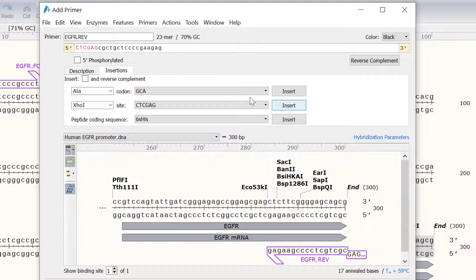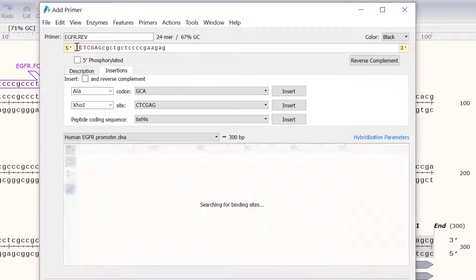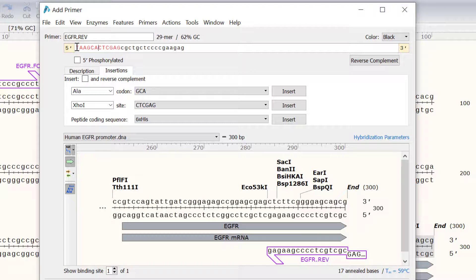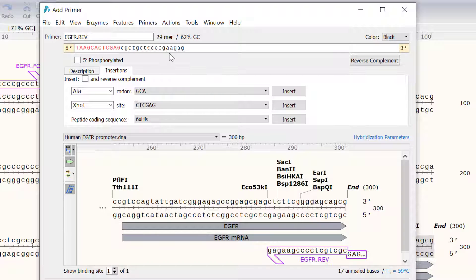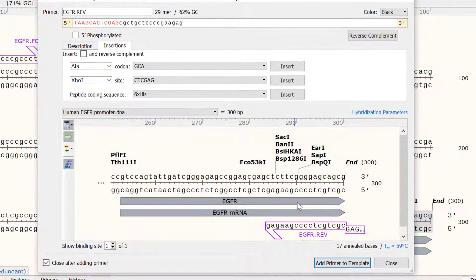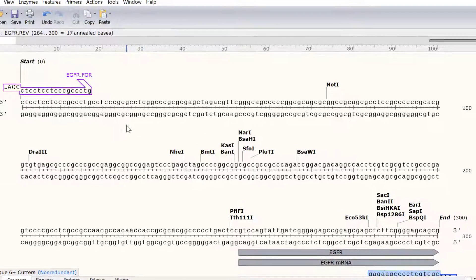I will also manually add the bases TAAGCA to the 5' end to improve cutting efficiency. And finally I will select the add primer to template button to add the primer to the file.